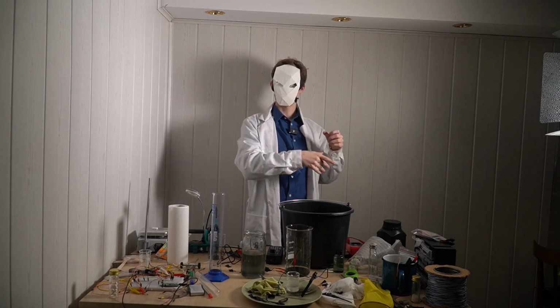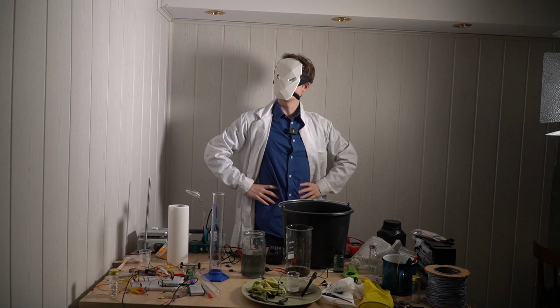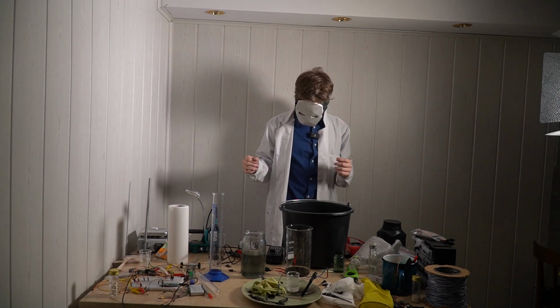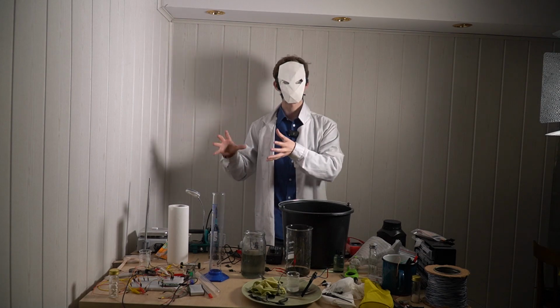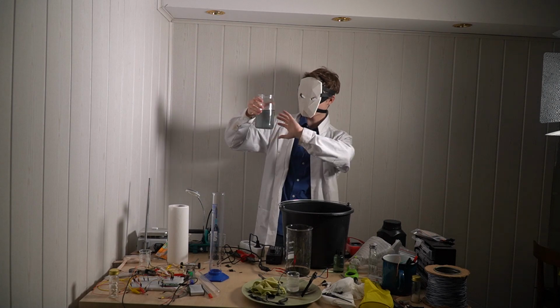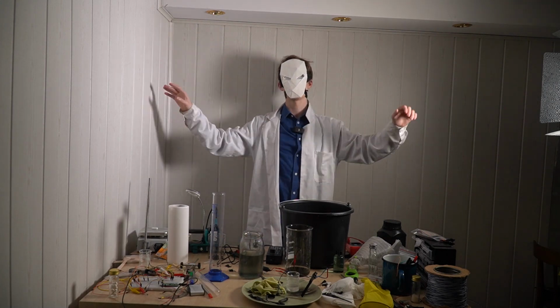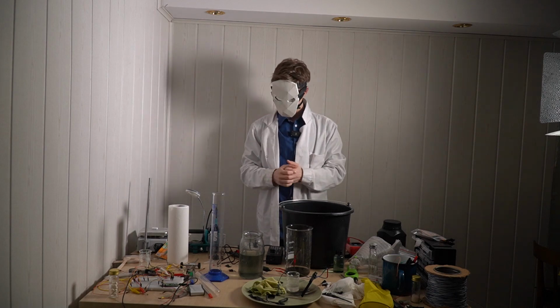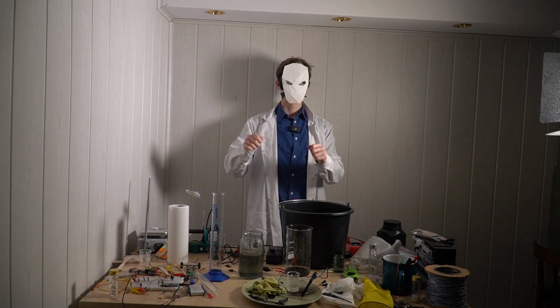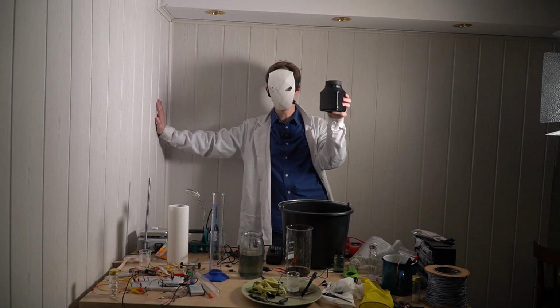The whole conclusion of that chapter was that, because my package with 2 kilograms of copper sulfate got delayed, I'm not going to do it in this video. I'll have a whole separate video in which we'll make 4 kilograms of sulfuric acid, which will be coming soon, and also pretty expensive. I would need to buy a platinum electrode for that. That's why we didn't make a full bucket of sulfuric acid, because my package got delayed for 2 weeks.